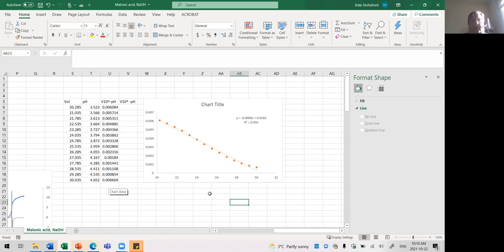And so this is where this extra column comes in handy, because what I'm going to do is move points out of this series and into the other series. And it's really easy. I'm just going to drag it over here. So now you can see this last point is gray instead of orange. It's in a different series. The R squared has improved. And we're going to look at the graph. What we want to do is we would like to see all of those points on the line. So our regression has improved and our R squared should also improve. So we had 9959, we're now at 9978.